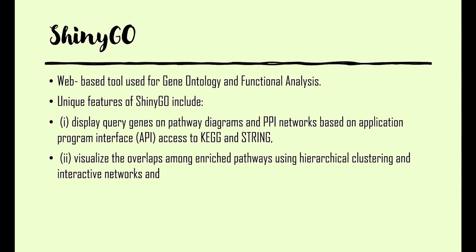Additionally, it can visualize the overlapping of the pathways. There are genes that perform various pathways, but how they interact can be visualized by the tool ShinyGo.